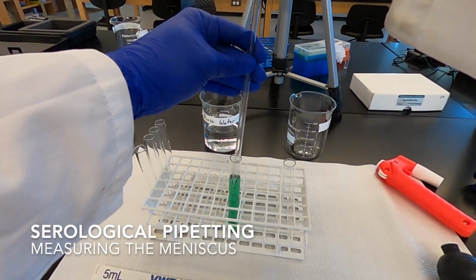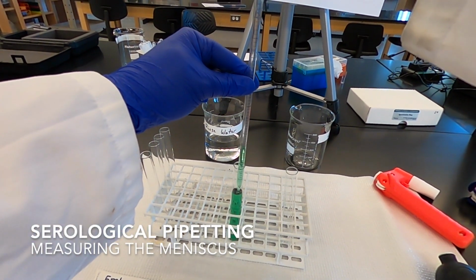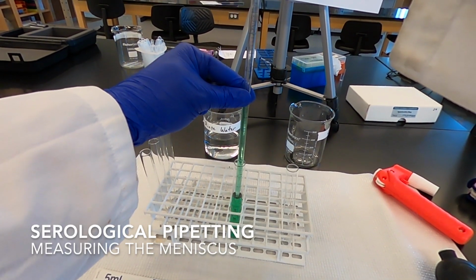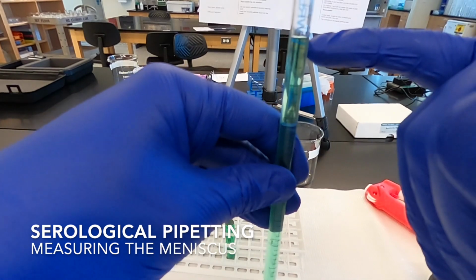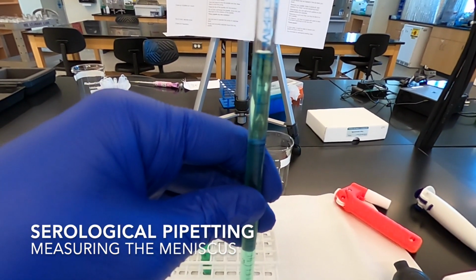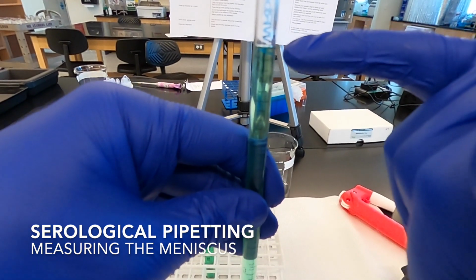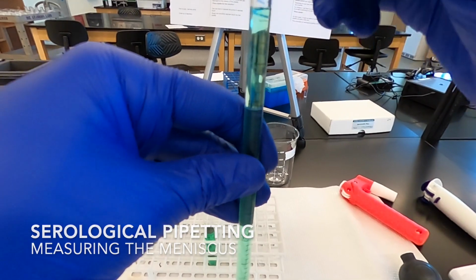So to measure the volume you pipette, you want to measure from the bottom of the meniscus. So I'm going to suck up some water here. And so from the bottom of the meniscus, it's going to be hard because my camera's at an angle here, but it should be even with this graduation. So I have in here 6 milliliters.